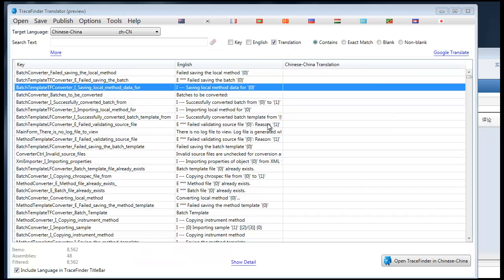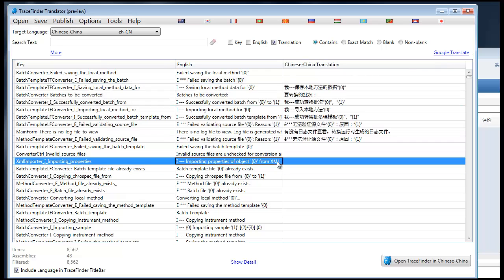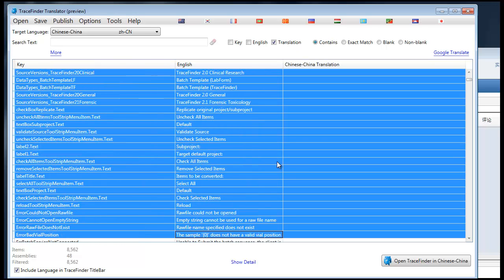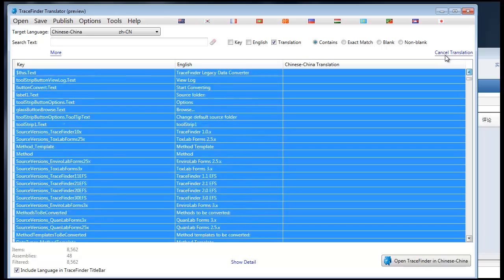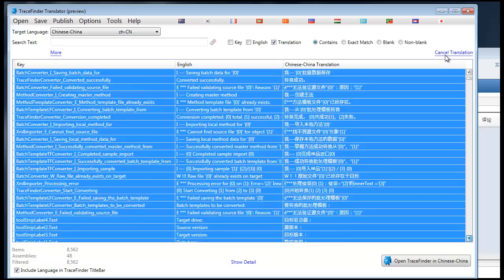I did want to demonstrate also the Google Translate feature, which will translate all the rows which are selected. You'll see that all the rows — which can be a large number of rows — will get translated one at a time. If you'd like to cancel the translation, press the Cancel button. This service does cost money, not very much money, a few cents per translation, but please use it wisely.